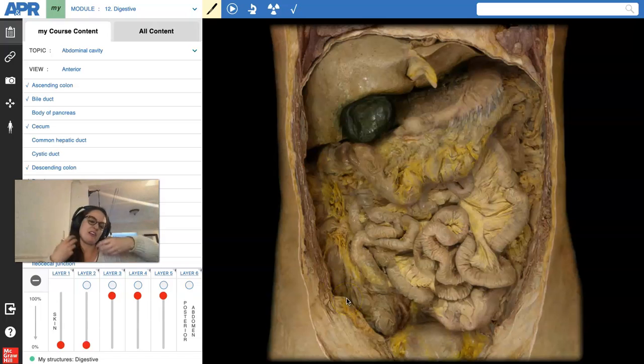If you've ever watched a horror movie and somebody cuts down here to disembowel a person and their guts just spill onto the floor, that wouldn't quite happen. The intestines would herniate out, but they'd still have a force sticking them to the posterior body wall, so they're not going to fall on the floor right away unless you've got a problem with your mesenteries. I like to call this better living through anatomy. You can figure out exactly what the horror movies get wrong.